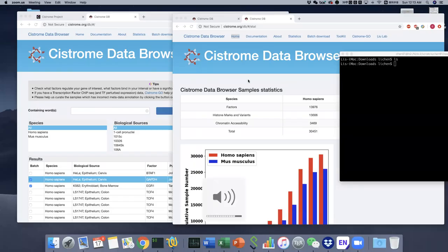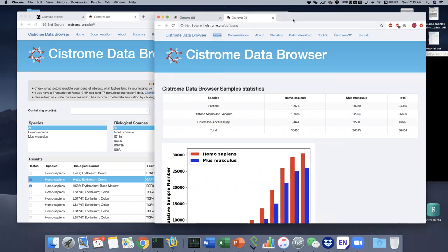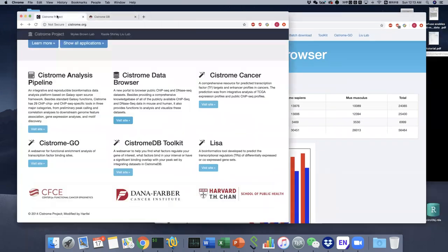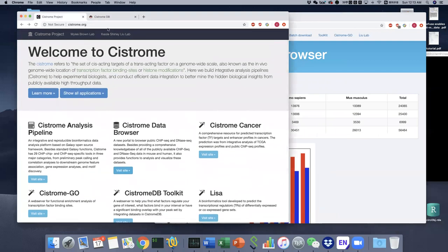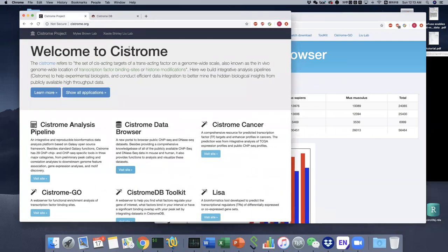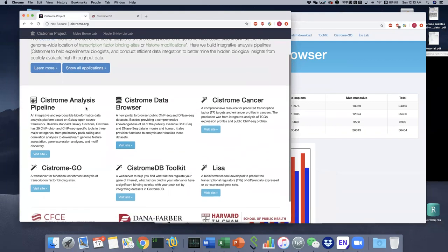Hello everyone. Today, I will talk about a very useful web browser, Cistrome. If you click the Cistrome website, you can see that this is a web server containing several useful tools.